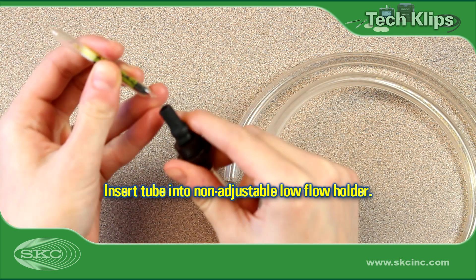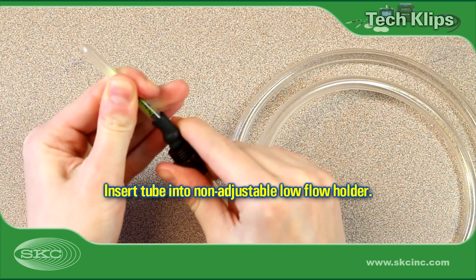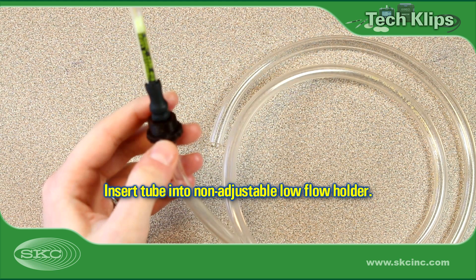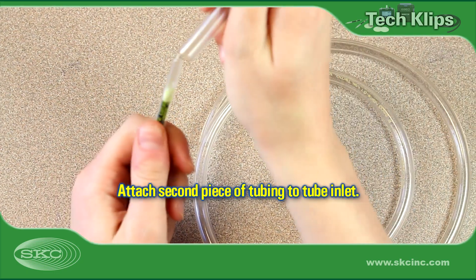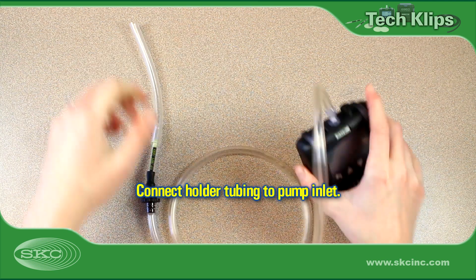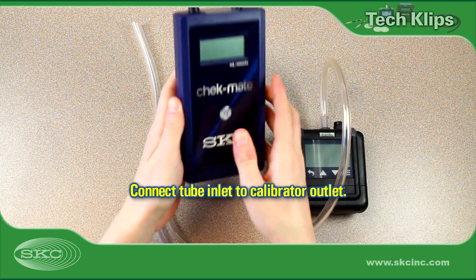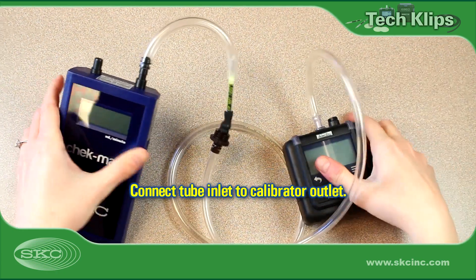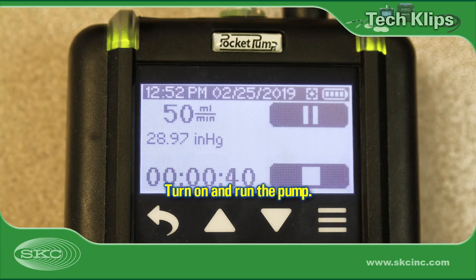Insert the open sorbent tube into the black rubber sleeve of a non-adjustable tube holder, such as the SKC 222 series holder, used for Pocket Pump Touch and other low-flow pumps. Attach a second piece of tubing to the open end or inlet of the sorbent tube. Connect the tube holder to the pump inlet. Attach tubing from the sorbent tube inlet to the calibrator outlet or suction port. After charging the pump battery, it is best practice to run the pump for five minutes to allow the flow to stabilize before calibrating the flow rate.